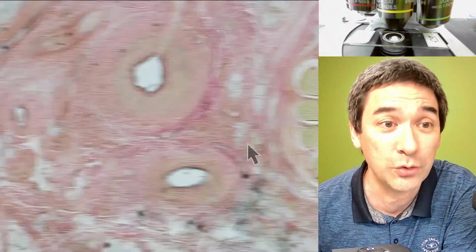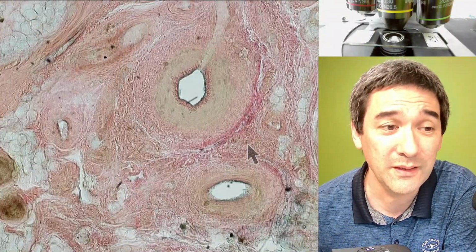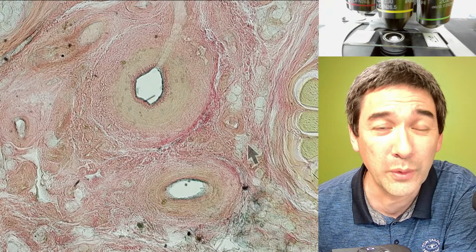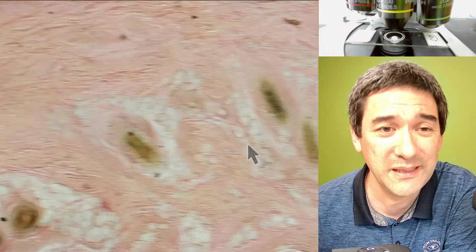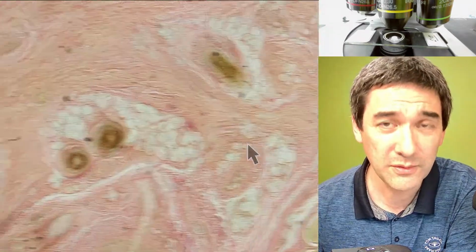favorite slides here. Again, 2 blood vessels here, but this kind of illustrates a little bit as well that if there is not a lot of movement going on, or if there's not a lot of color contrast going on, then sometimes it can be kind of abstract. And I once made the mistake. So never ever do that.